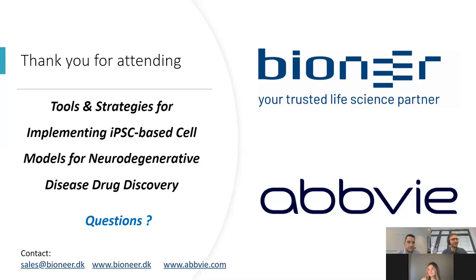Yeah, excellent question. This is a very good one because, yes, there are. This is one of the reasons why I always say that differentiation protocols are only as good as long as you find out that they are not working. So we have seen that there are certain iPSC lines that are reluctant to a specific differentiation process. This is also widely described in the literature, but yes, if you want to really be sure, you have to try it out. But nevertheless, also with time, you are going to end up with more reproducible protocols, of course. So this is a process that goes together. But that happens, yes.